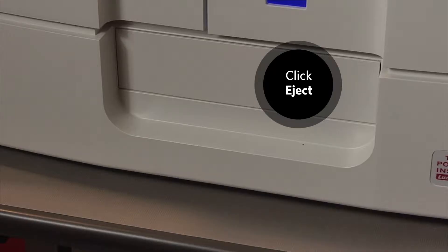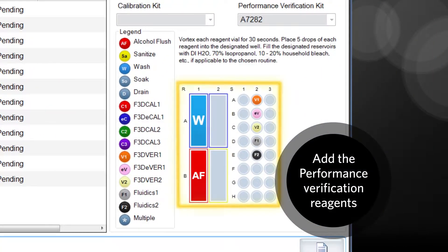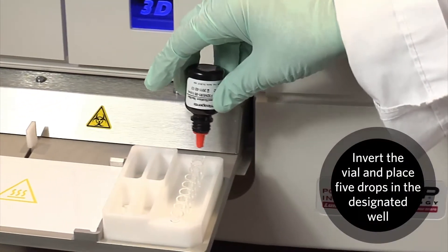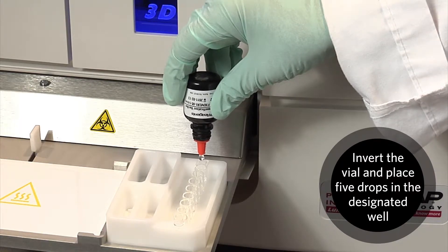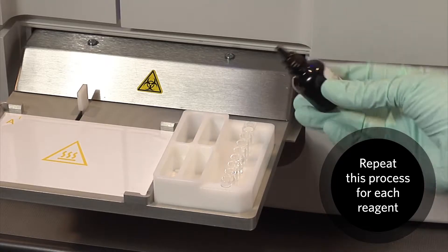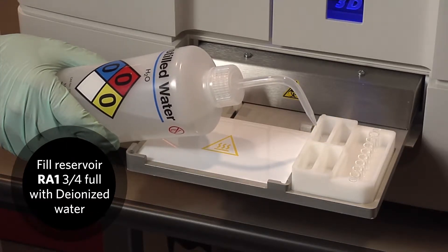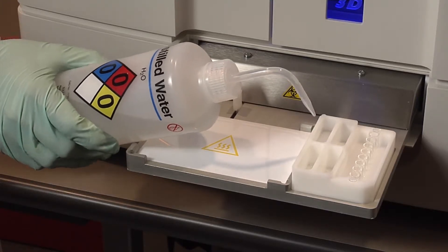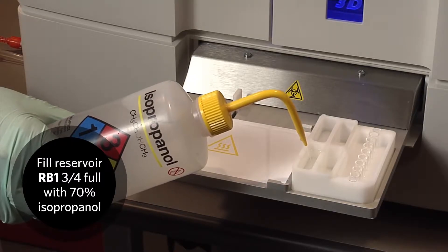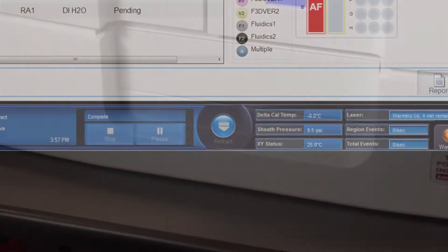Click eject. Add the performance verification reagents following the instructions provided on screen. For each reagent, vortex the vial, invert it, and place 5 drops into the designated well. Repeat this process for each reagent. Fill reservoir RA1 three-quarters full with deionized water. Fill reservoir RB1 three-quarters full with 70% isopropanol. Click retract, then click run.